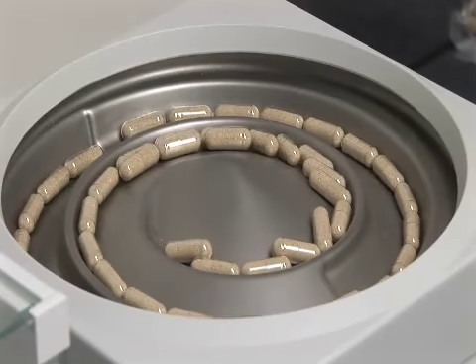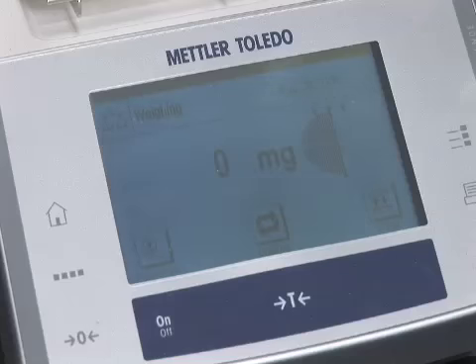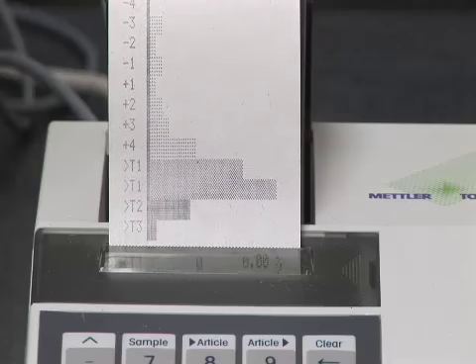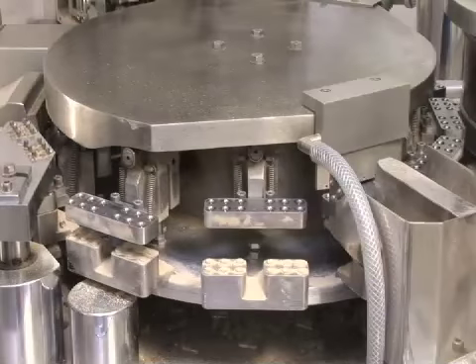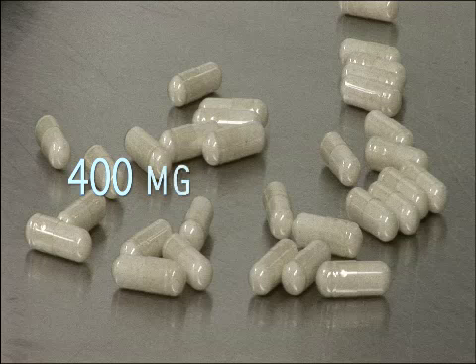At the same time, a QC inspector takes samples at specified intervals for an automatic weight checking that gives a statistically precise weight record for the batch. Nulab's target for filling is 105%. This means that if the formula has a fill weight of 400 milligrams per capsule, we aim for 420 milligrams.